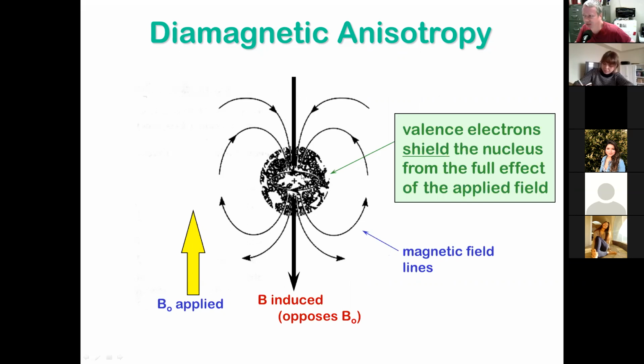You got shielding, but if you got a chlorine over here or a ketone or something electronegative, it's going to de-shield the proton. And where do protons come if they're de-shielded? Downfield or upfield? It's downfield, which is to the left. Yeah, you got it. That's the basic idea. We'll see some more examples in a second.